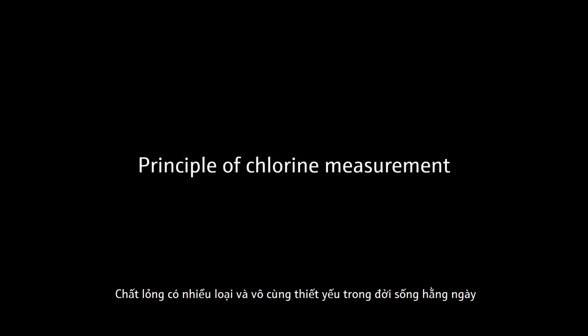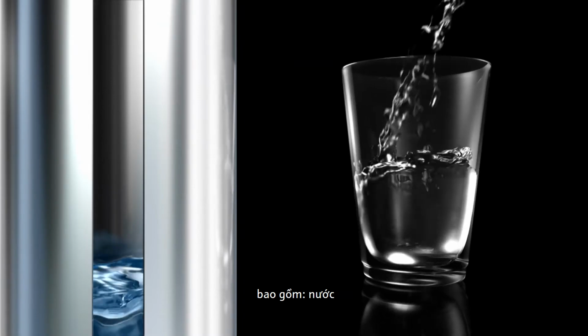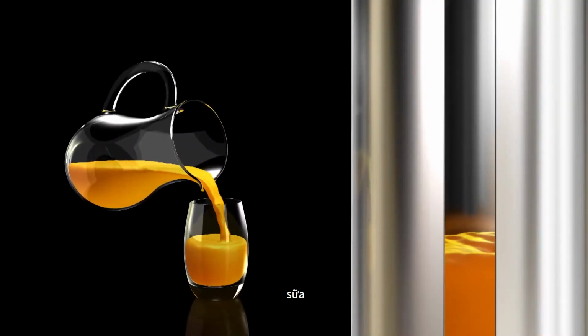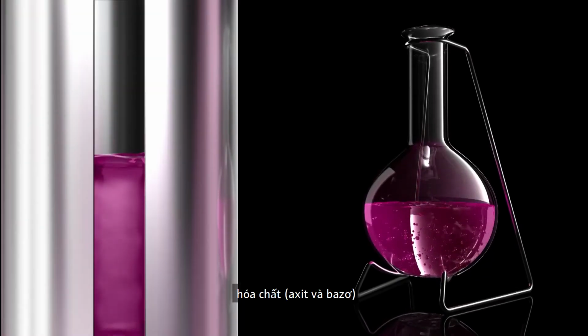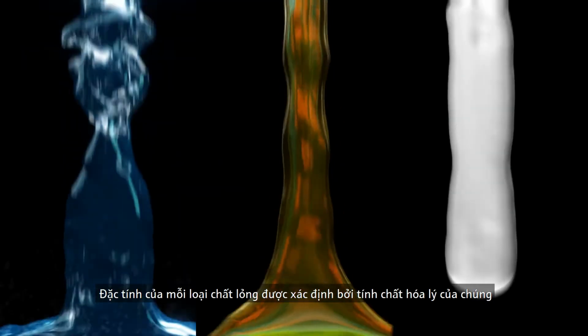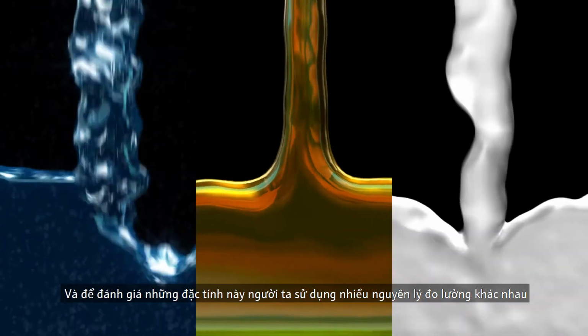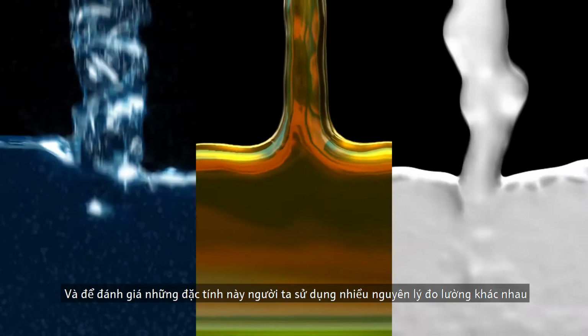Many liquids are essential in our daily life. They may include water, beverages, dairy products, chemicals, acids and bases, or pharmaceutical products. The quality of these liquids is determined by their chemical and physical properties. To assess these properties, various principles of measurement are used.